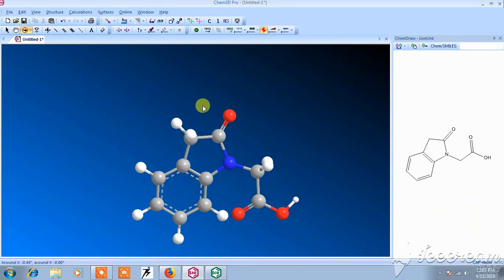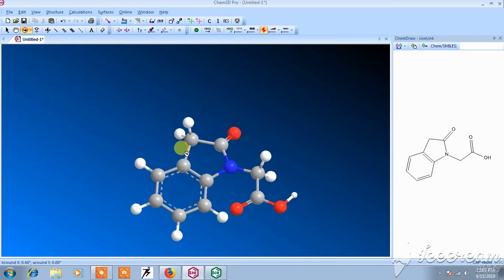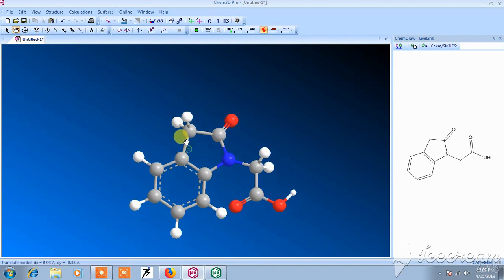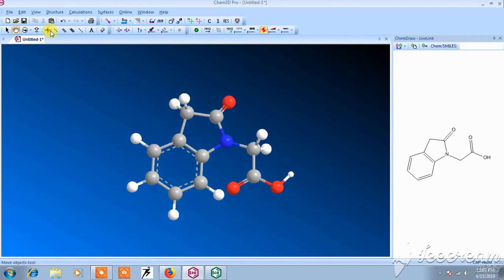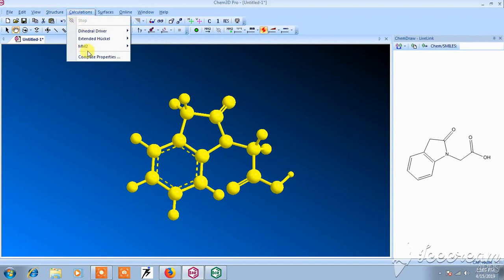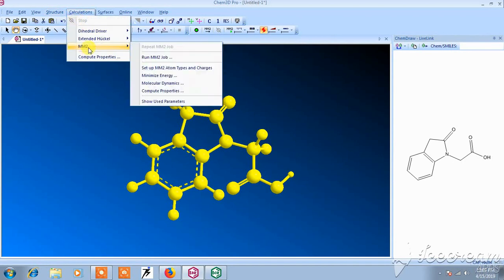Now we would like to do the energy minimization studies. Select the structure, control it, and go to calculation MM2. Here, select minimize energy.